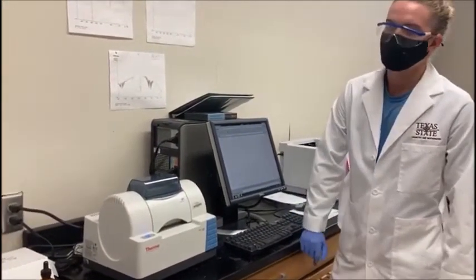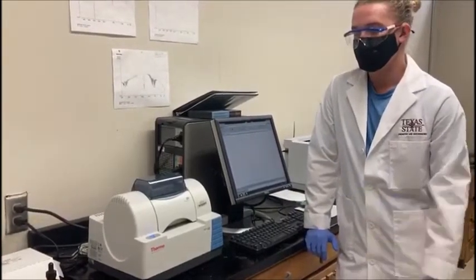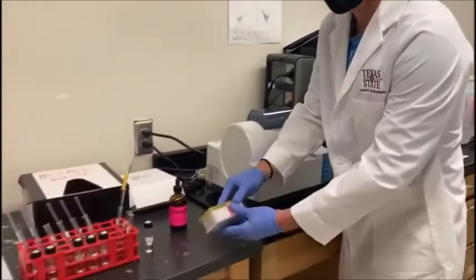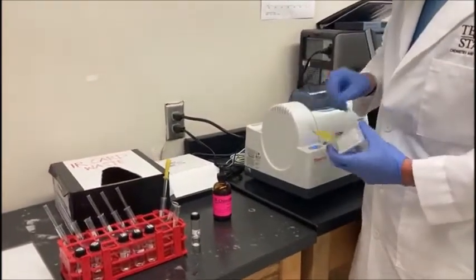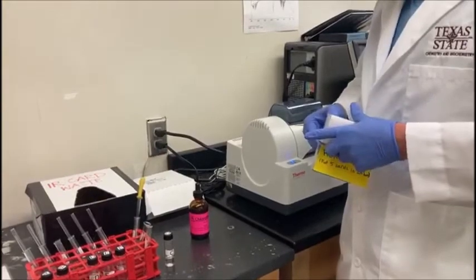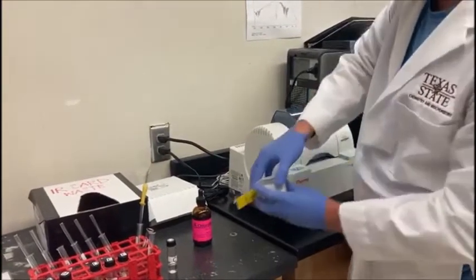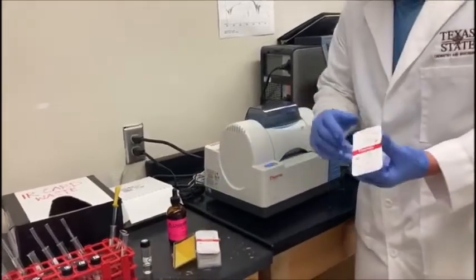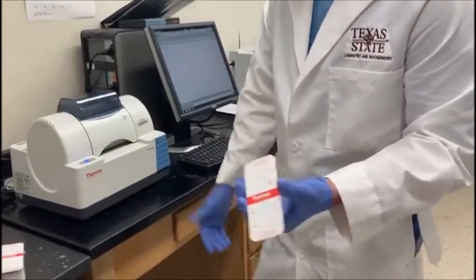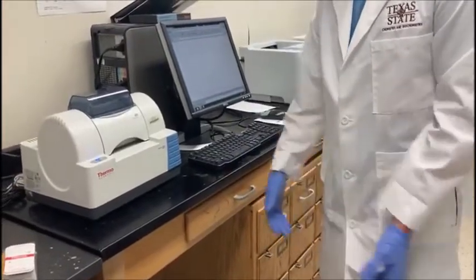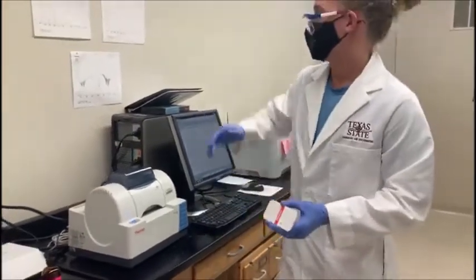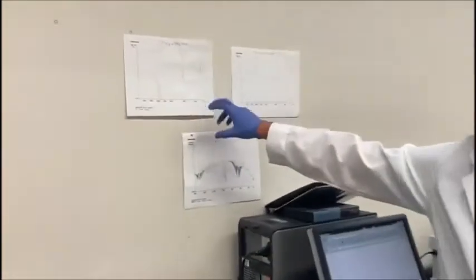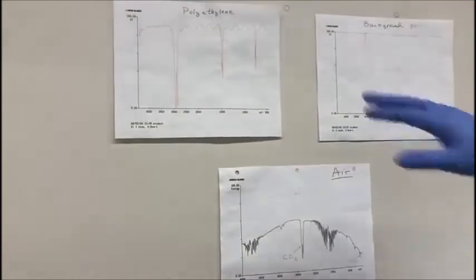The first thing you'll need to do is collect a spectrum of your solvent. The reason for that is your IR machine will detect pretty much everything that's in your sample. So these are the sample cards. This film here is polyethylene plastic, so your software will detect the polyethylene plastic, the air, and water in the air. For that reason we have a background spectrum that the software will automatically delete.